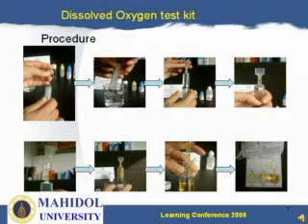Release the water sample a little bit in the little cup. Add 1 drop of DO2 reagent. Then block the hole on the tip of the syringe. Shake for 30 seconds. Step 4. Unblock the hole of the tip of the syringe. Release the water sample a little bit in the little cup. Drop 4 drops of DO3. Then block the hole on the tip of the syringe. Shake until the precipitate turns to a clear solution.